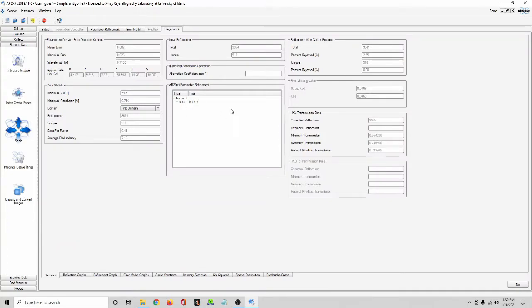So not too bad. If I went down to triclinic, it would be better, but it would be inaccurate. This structure is probably not triclinic. This particular one is not triclinic, or it's just not very well described in that way. It's too close to being monoclinic statistically.